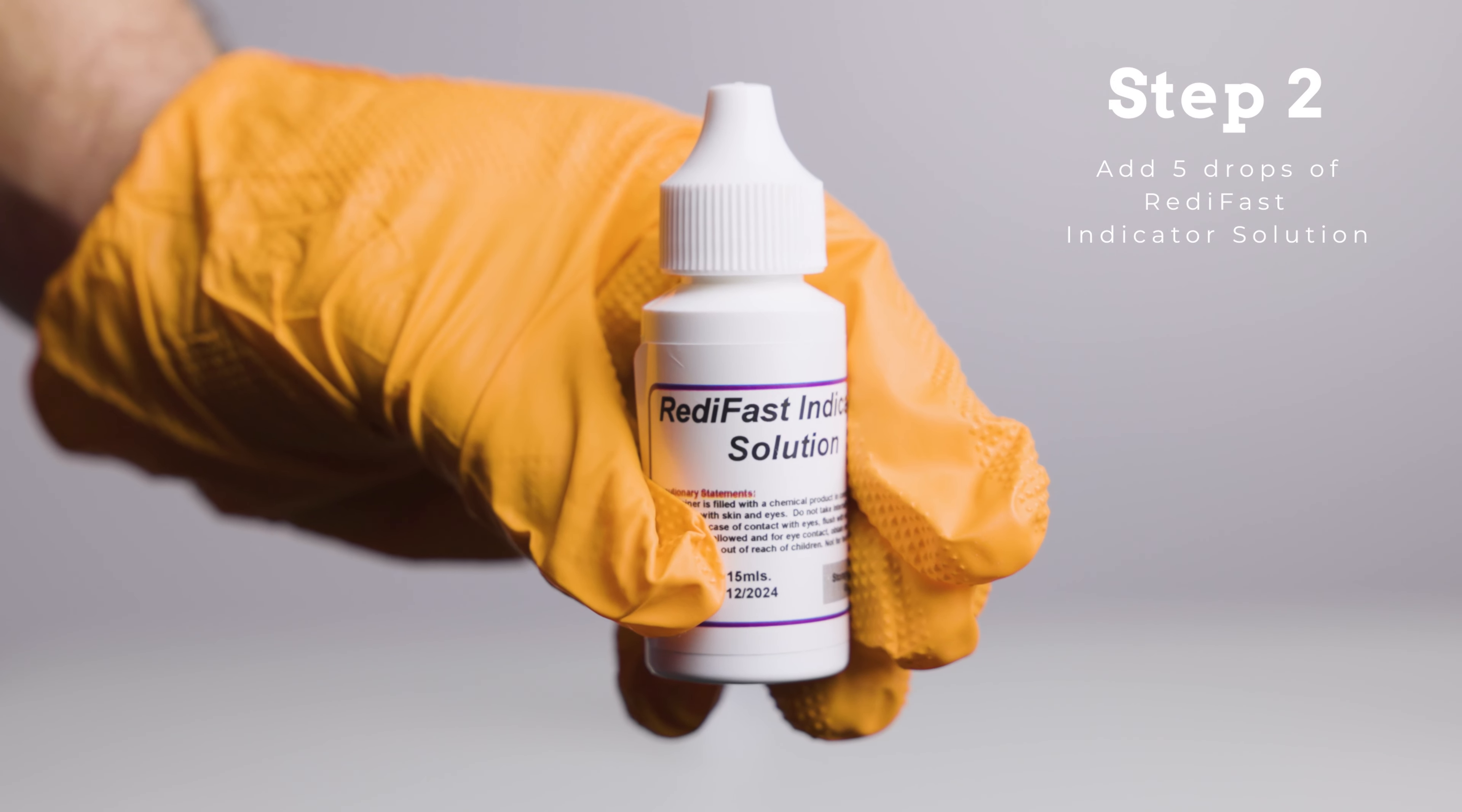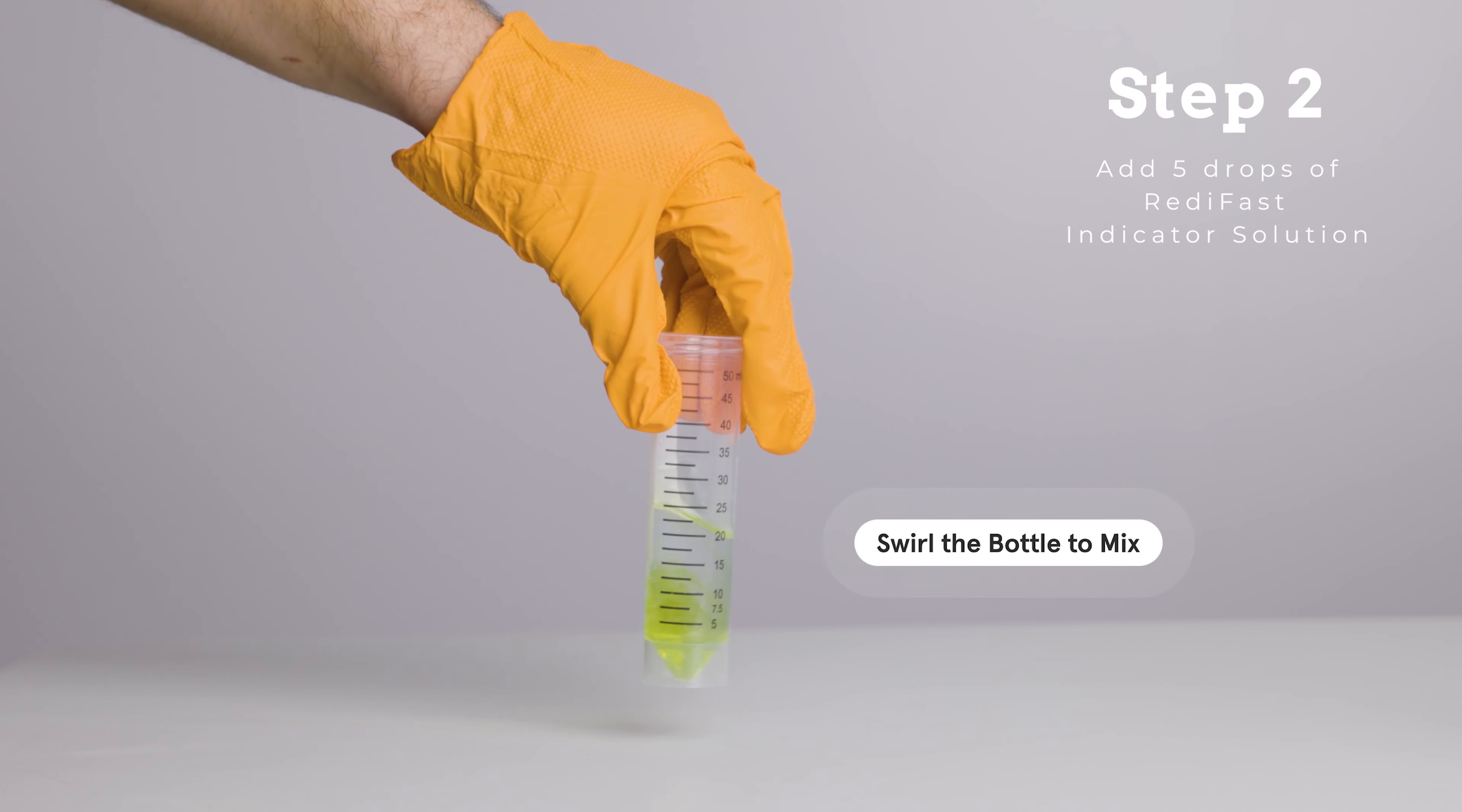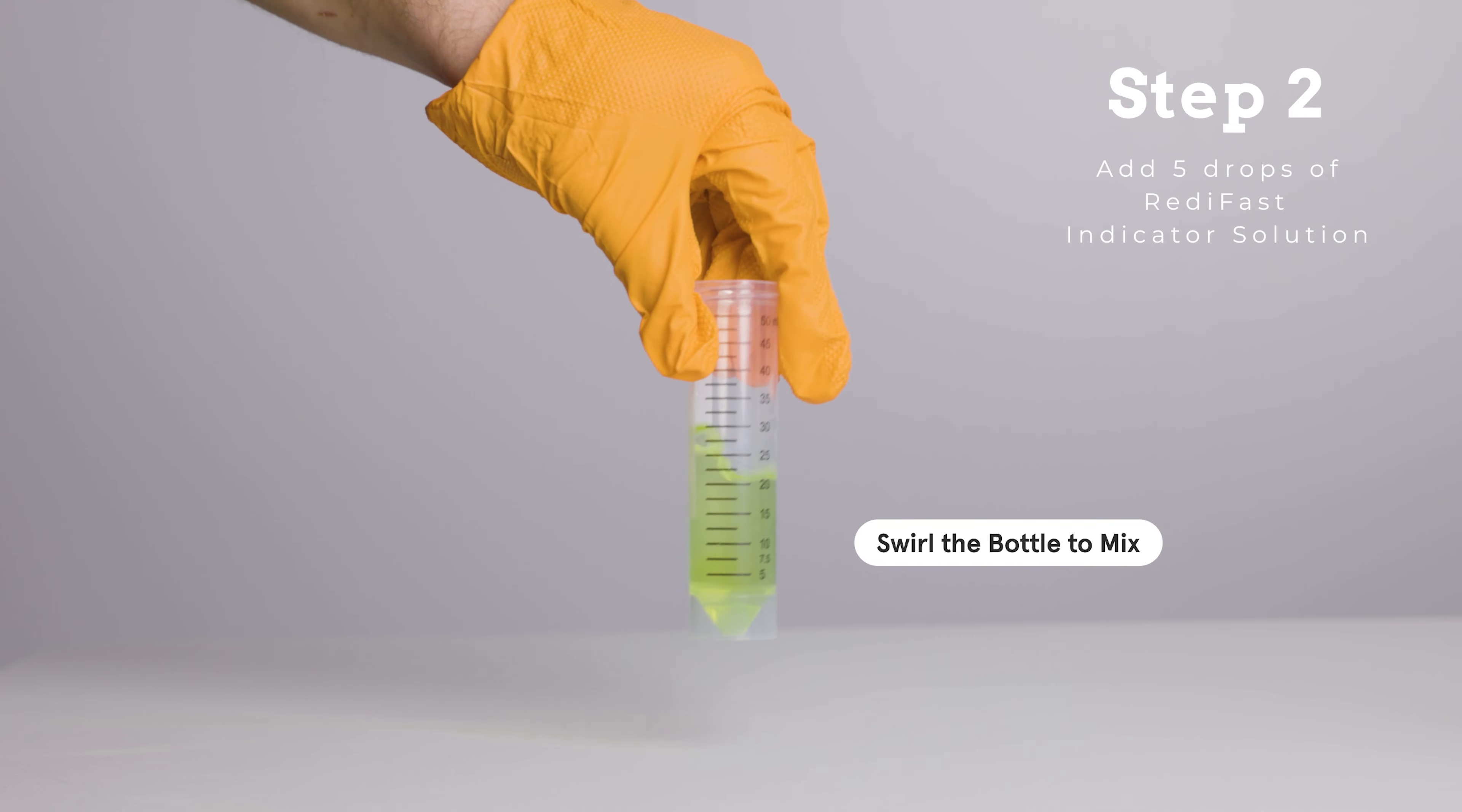Step 2. Add 5 drops of Ready Fast Indicator Solution, then swirl the test bottle to mix. The sample should now be lime green in color.